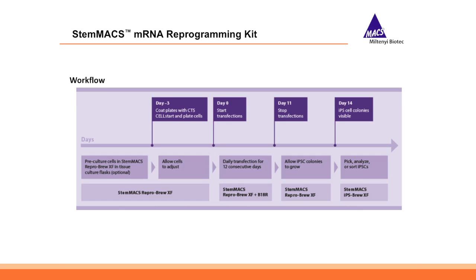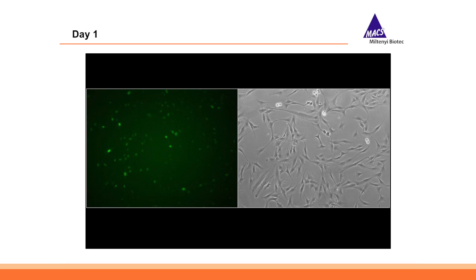Then we change the medium to iPS brew medium, and iPS cell colonies are visible. And I want to do that with you, more or less live.